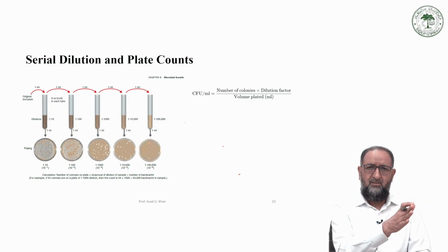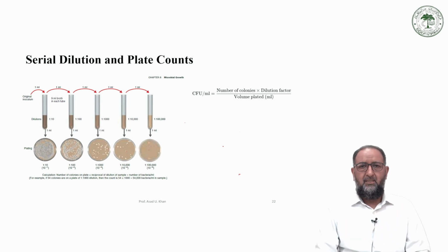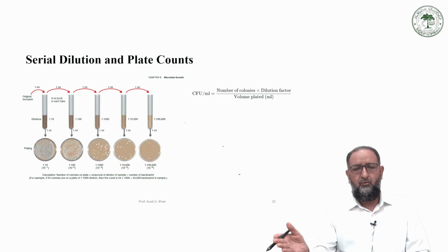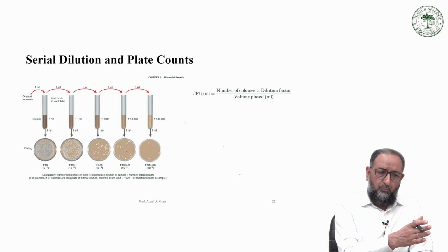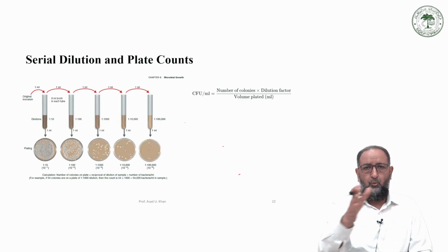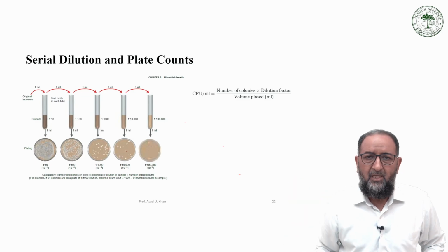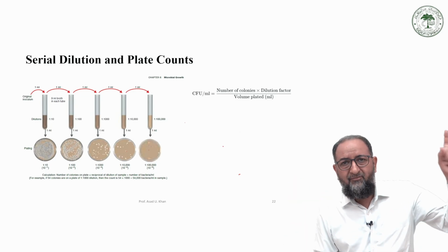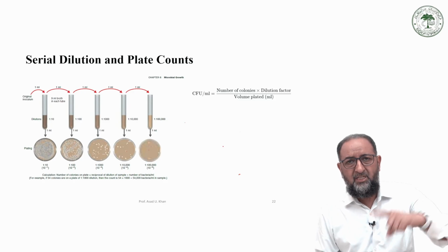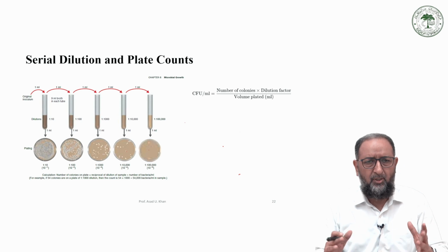In the first glass, number 1, very sweet, because 2 tablespoons in 1 glass, then it reduces by 10-fold, then 20-fold, 100-fold, 200-fold. So, as you move from high concentration to low concentration, your dilution factor is increasing, right. Now, when you calculate the dilution factor, you multiply it by the factor to which it was diluted, all right. So, this is how you calculate this, and this is the simple logic involved in that.